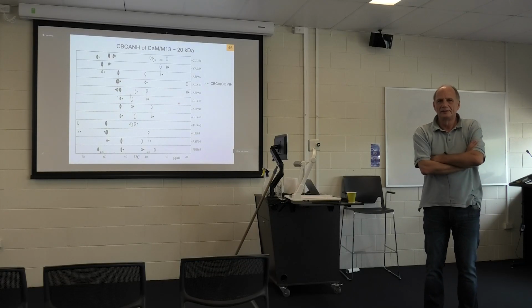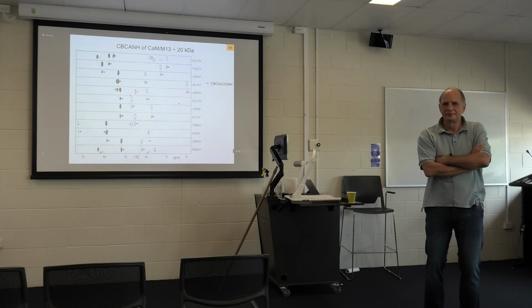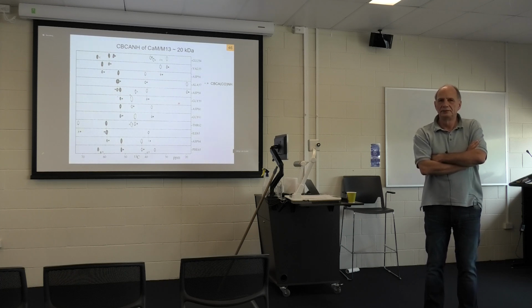You look at a Bruker pulse program, and they tend to have a constant time evolution for the nitrogen, after the evolution of the carbonyl carbon in the HNCO, for example. Is there any difference whether you do it before or after? I would not think so, no.